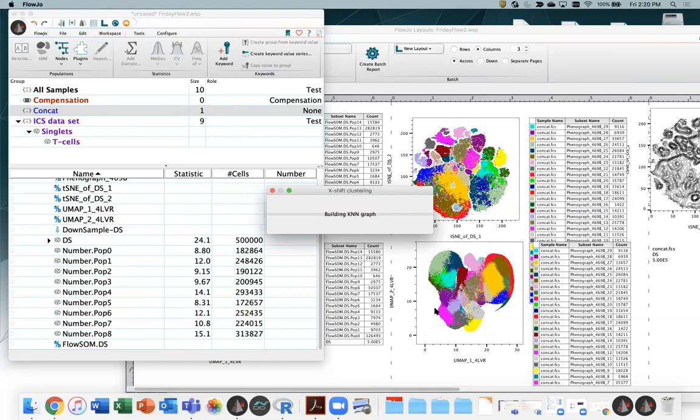How are we doing time-wise? Time-wise, we are almost at the end here. So I think this will be the last thing we do. And then perhaps I will quickly just again mention that Cluster Explorer is a fairly nice tool for exploring any of these, and you can use any of the dimensionality reduction tools or clustering tools with it, and switch between if you'd like.